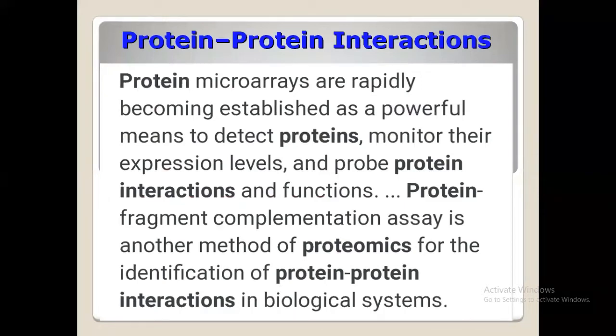Protein microarrays are rapidly becoming very important and being established as a powerful source to detect proteins. Suppose you have a protein inside the cell and you want to detect it, we have protein microarray techniques.